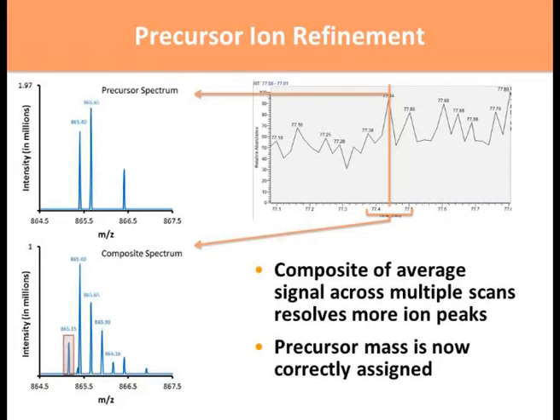And in order to get to this actual value here, Kojak uses a boxcar averaging algorithm to produce a better resolved precursor ion. And what this is, instead of looking for the precursor in this single slice of time in this chromatography, it takes a window where it selects that single spectrum plus the neighboring precursor spectra around that event, and averages them together. In the neighboring spectra, some of these other peaks might have been resolved. If there's any noise in the area, usually the noise is reduced.